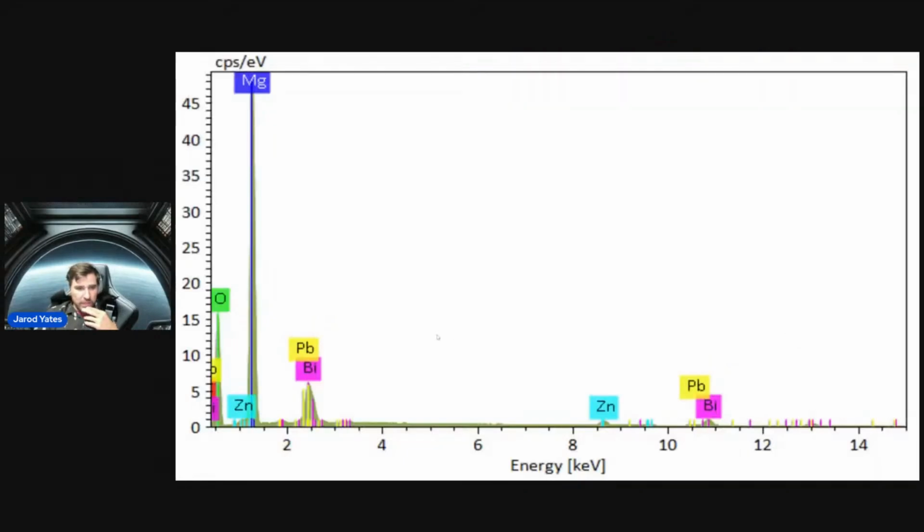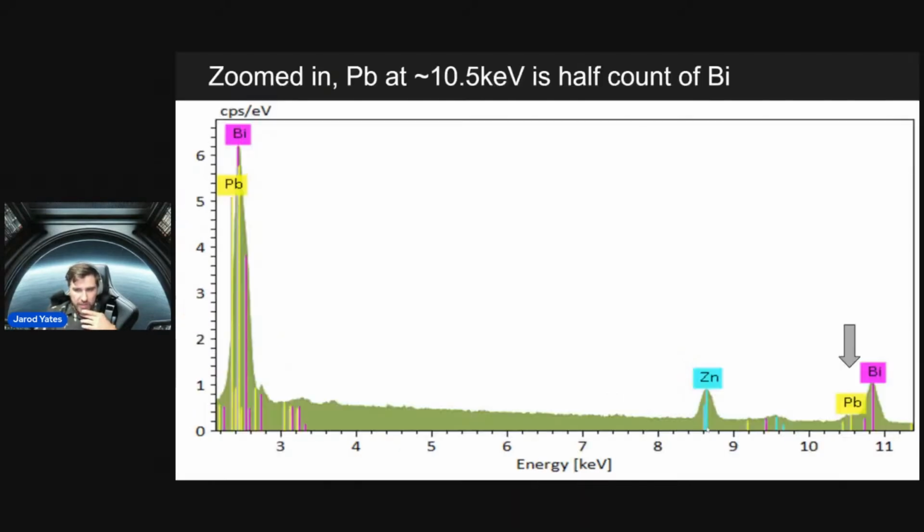Looking at that under the spectra here, once again, we got the noise floor down here, but we do have the zinc, the magnesium. We can see that we do have bismuth and lead. We're still kind of low. We got our zinc in the more trustworthy area of brightness up here. And then we got the lead bismuth up here, even more trustworthy. Let's zoom in on that.